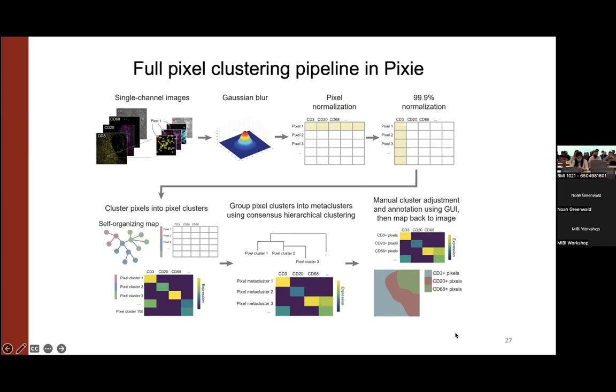So in my head, it's just this pixel normalization step here. I can imagine that it works with MIBI data really well after you apply the blurring, because then there is essentially not much noise. But when there is high frequency noise, you would just upscale this, and your pixel clustering maps would look grainy and noisy, right?